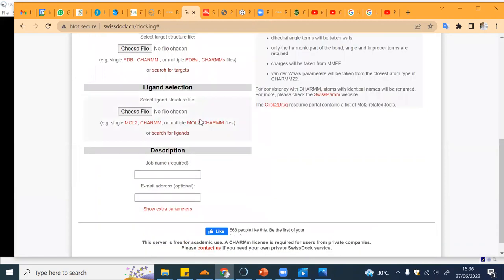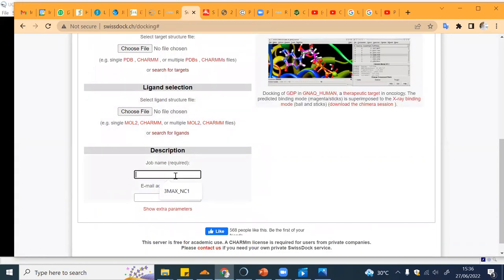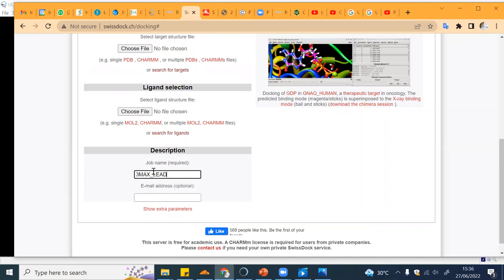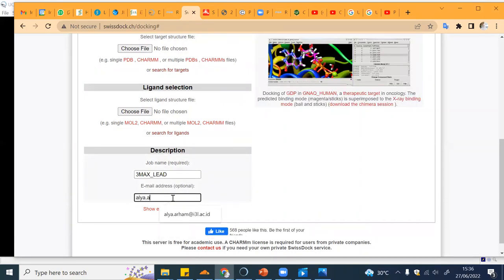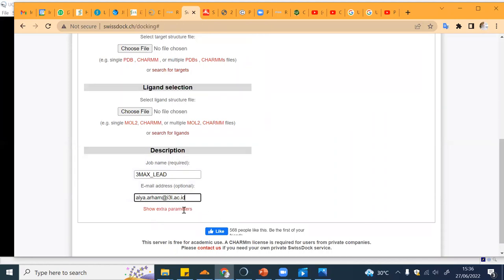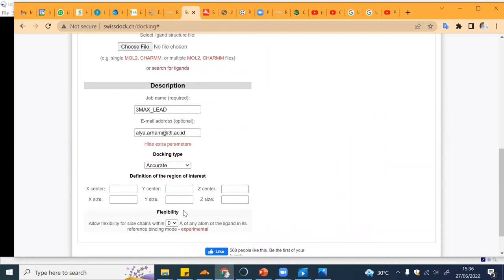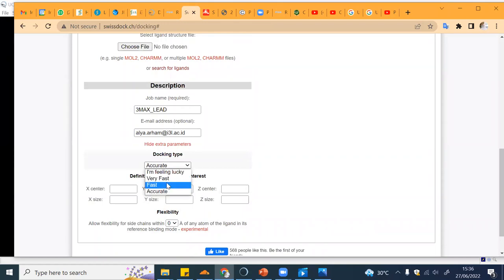After that you can put the job name, for example 3MAX lead, and then you put your email. You can add extra parameters. For example, if you want your docking to be very accurate you can click on that one. If you want very fast but usually less accurate, you can use this one.